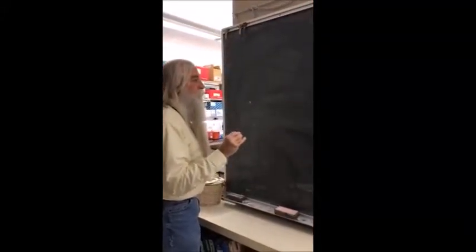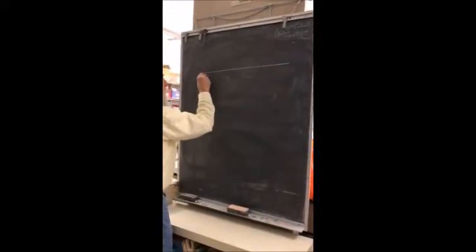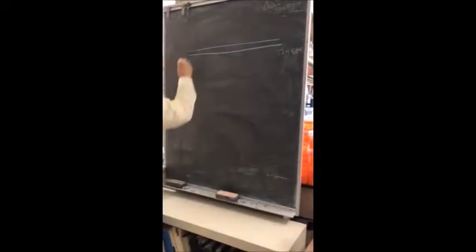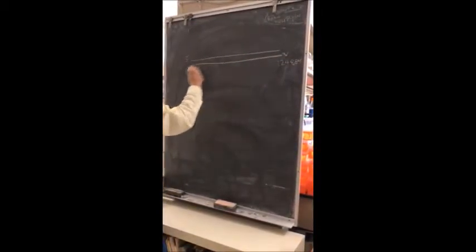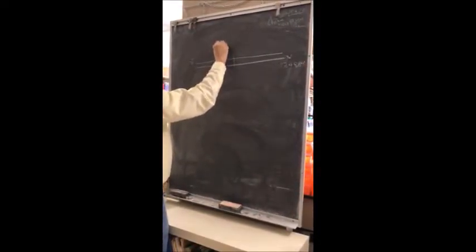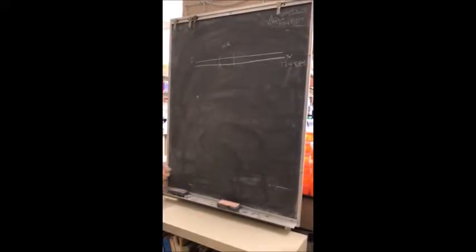All right, so what we're doing here is we're trying to clone a region of the virus DNA. The VZV DNA is a long segment of DNA that's got like 124,884 bases. It's got a 5' and a 3', and it's got various genes along the way. What we want to do is clone out one of these regions, and we're just going to call this WR for lack of any other reason.